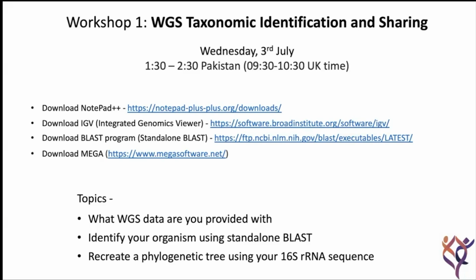If we have time at the end, we want to help you recreate a phylogenetic tree using your 16S sequences that you've acquired from your data.